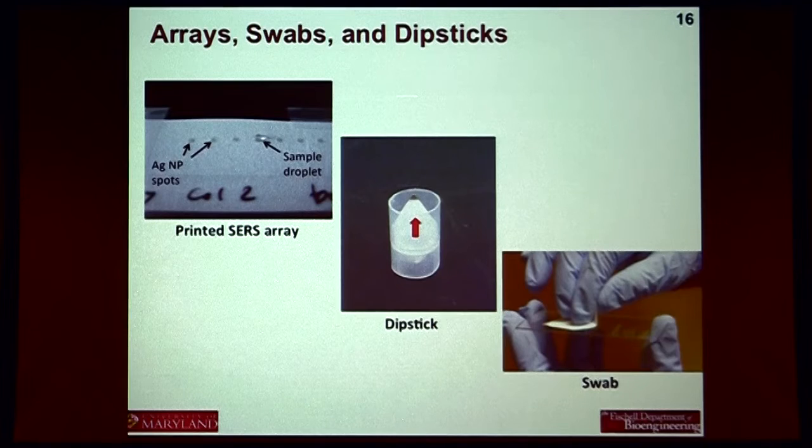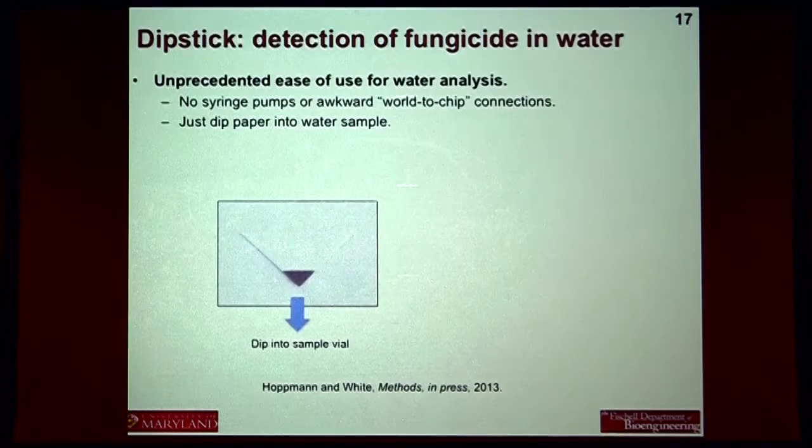So we can collect water samples, anything wet, with a simple dipstick operation. And we can also compare this concept to microfluidics as well. And of course, it seems relatively obvious, but because of the flexibility of paper, we can use it as a swab. As compared to that silicon device that's been nanofabricated, it would be hard to imagine taking that and swabbing a very complex surface, which we could do with paper. So really, these two features start to separate paper a little bit based on its functionality. And this is where I look at it as, instead of having several components to do several things, can I get one component that does everything the system needs? So let's look at breaking that down.